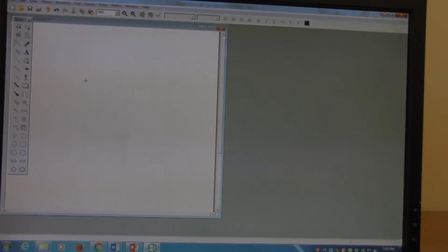Today's topic, molecular modeling. You'll be drawing Lewis dot structures, which I'm sure you've been working on in class, and using a program in lab called ChemDraw to represent them. This is what you see when you open up ChemDraw. I'm going to walk through drawing the structure that you have instructions for, the first one in your lab manual.